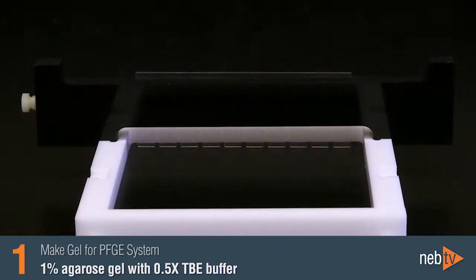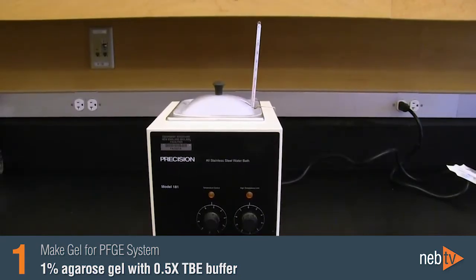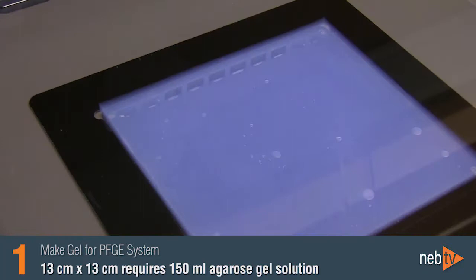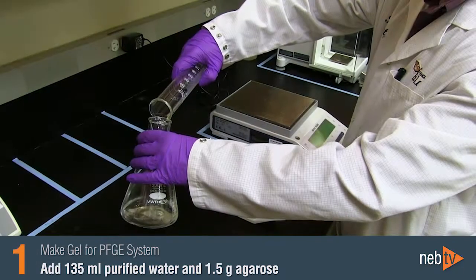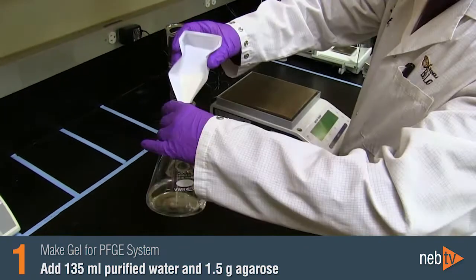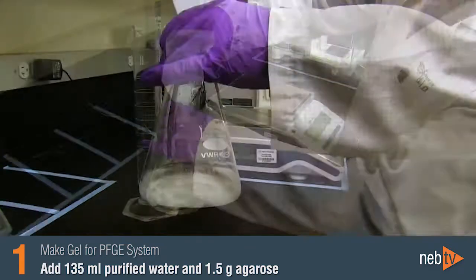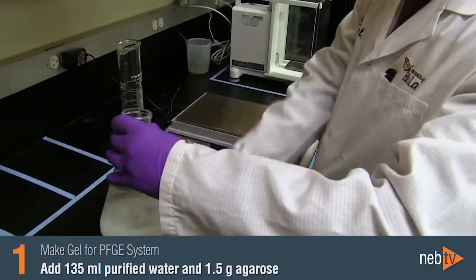For this, you'll need a gel casting system compatible with your PFGE system and a water bath previously set at 60 degrees Celsius. This gel cast is 13 centimeters by 13 centimeters, which requires a 150 ml agarose gel solution. In a 500 ml flask, add 135 ml of purified water. Then slowly add 1.5 grams of agarose to the flask. Swirl the flask to disperse the agarose powder in the solution.